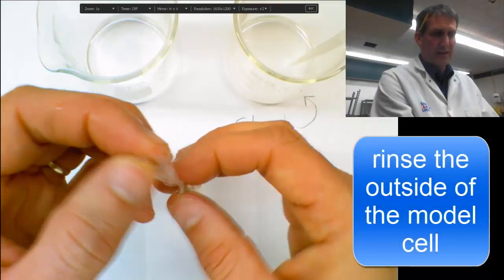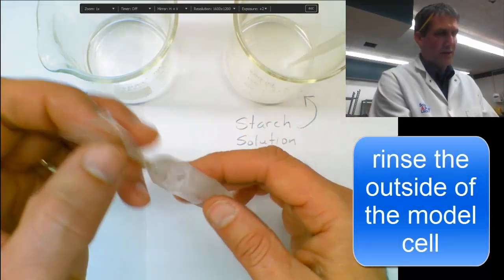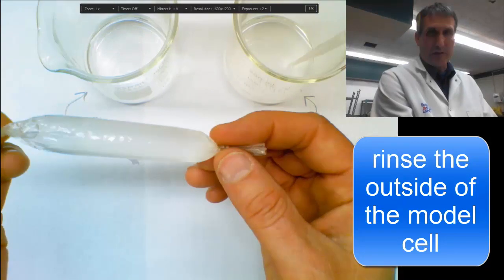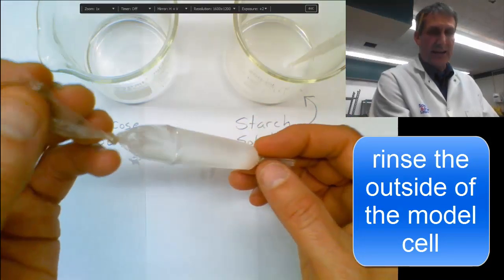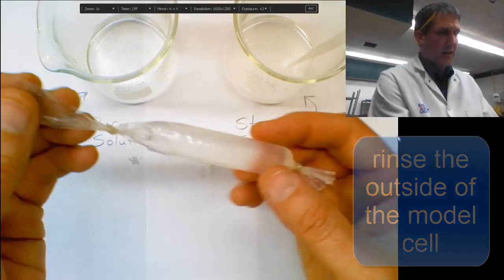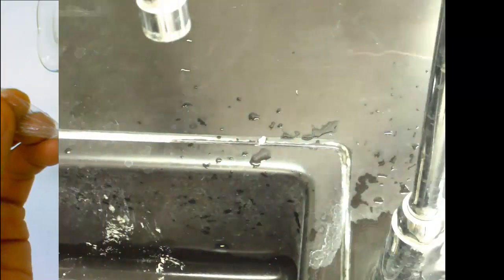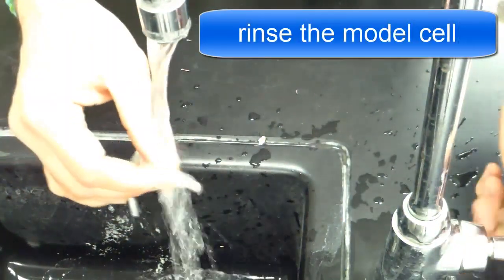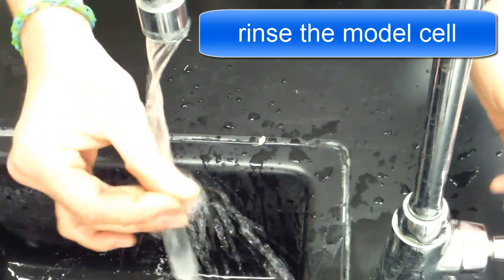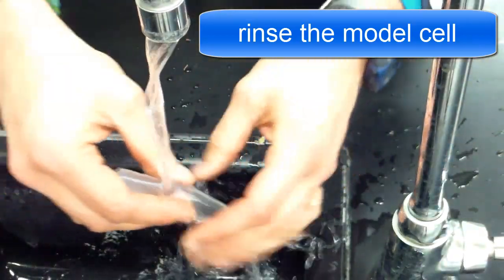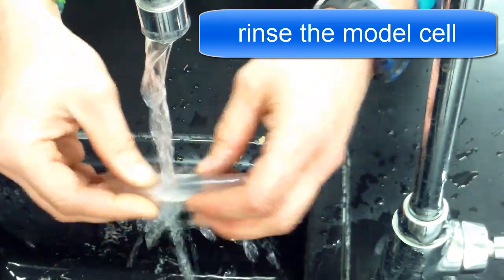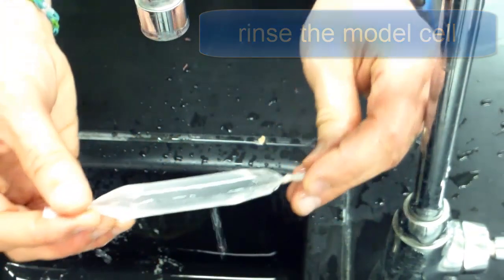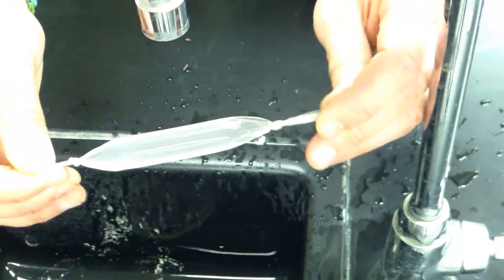Now, it's important to rinse the cell under the water next so that you rinse off any glucose or starch solution that's in these ends. Because we want to see if anything diffuses through the membrane. So we want to start with a cell that has been well rinsed and doesn't have any starch or glucose solution on the outside. Alright, here we are back at the sink and we have our cell tied at both ends. I'm going to make sure that I turn the water on and rub my fingers back and forth and really rinse out, rinse the cell and rinse the ends to make sure that there's no excess glucose or starch solution on the outside of the cell. And now I'm ready to put it into a beaker.